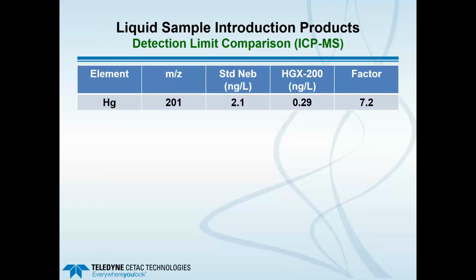At that particular mass, we can then push the detection limit below a part per trillion, down to about 0.3 ppt. With ICP-MS, of course, how far down you can push often may depend upon the cleanliness of the reagents and the cleanliness of the lab. So as ICP-MS is so sensitive, you'll probably see perhaps up to a factor of 10 improvement in the detection limits, again, depending upon the cleanliness of the reagents, vessels, and the lab overall.